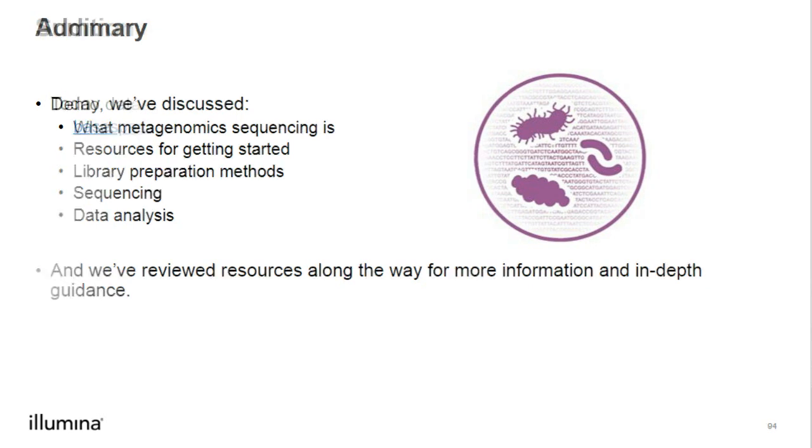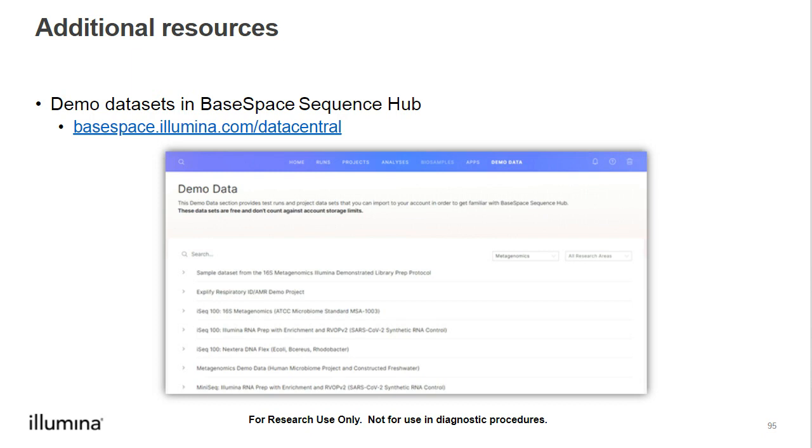Public datasets are available in BaseSpace, which give run performance metrics and example analyses. Public data can be found in the Demo Data tab in BaseSpace and can be filtered based on our project interest by searching or selecting categories in the right-hand panel.